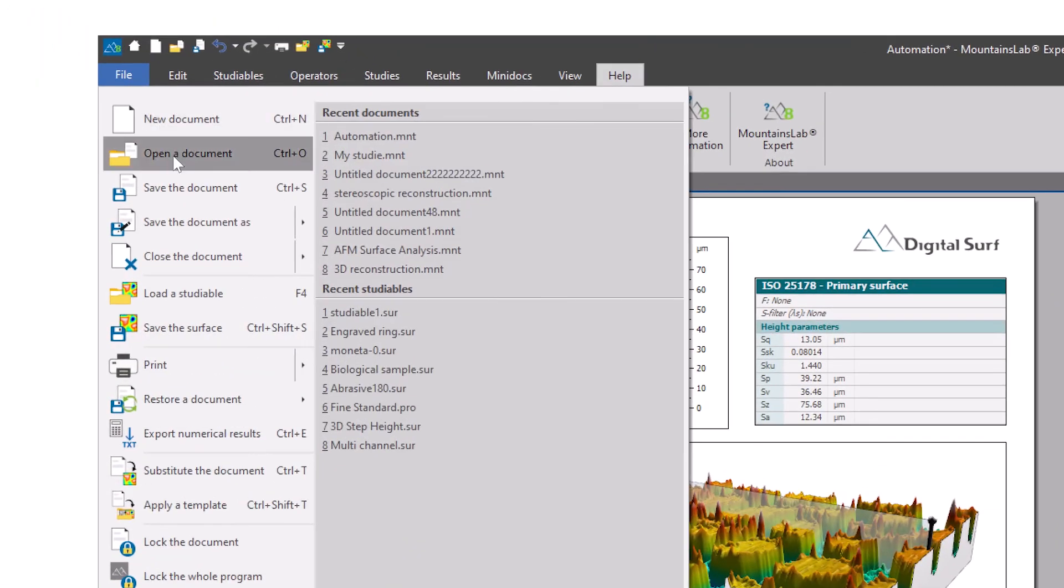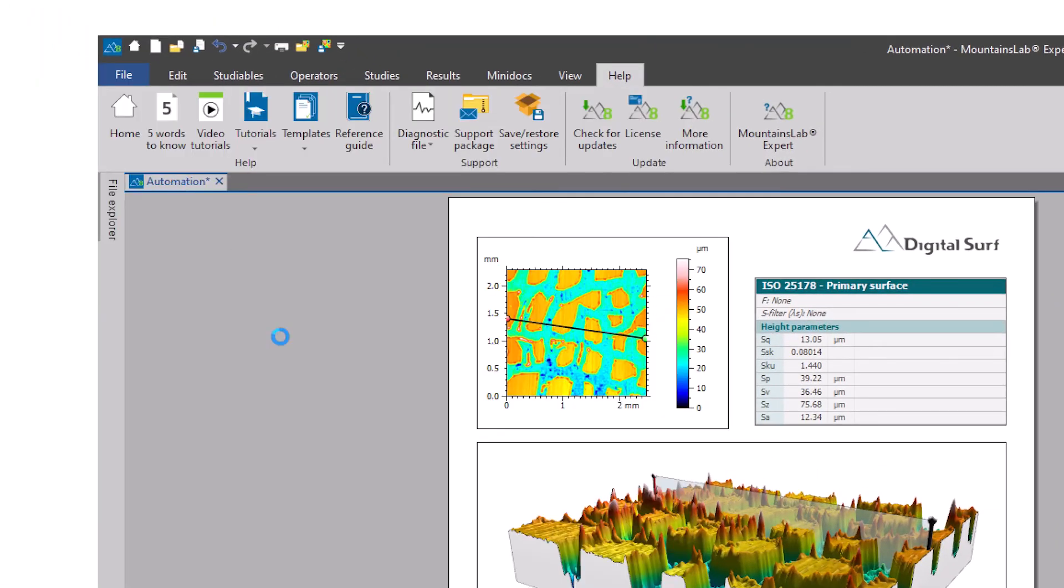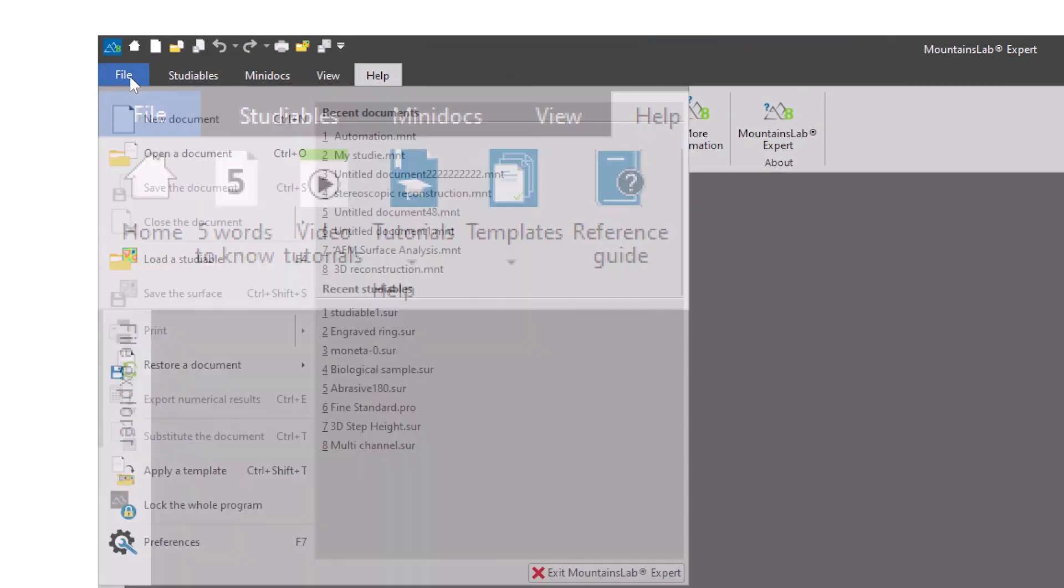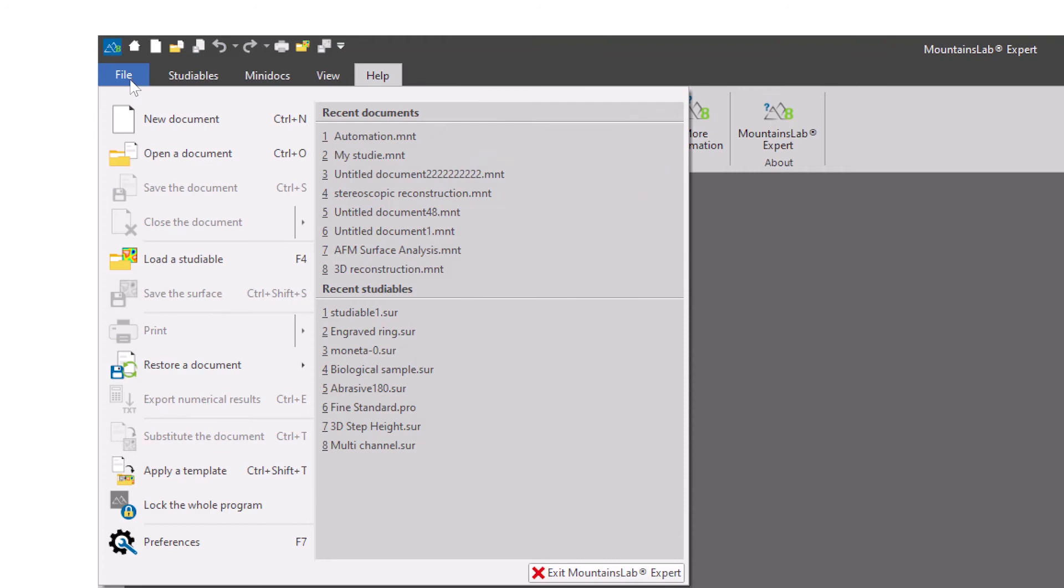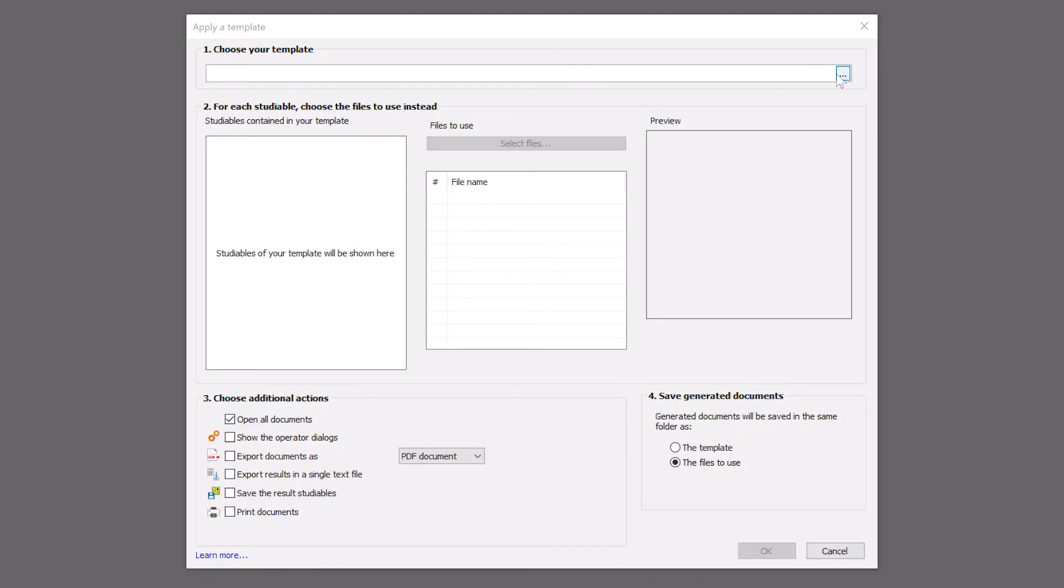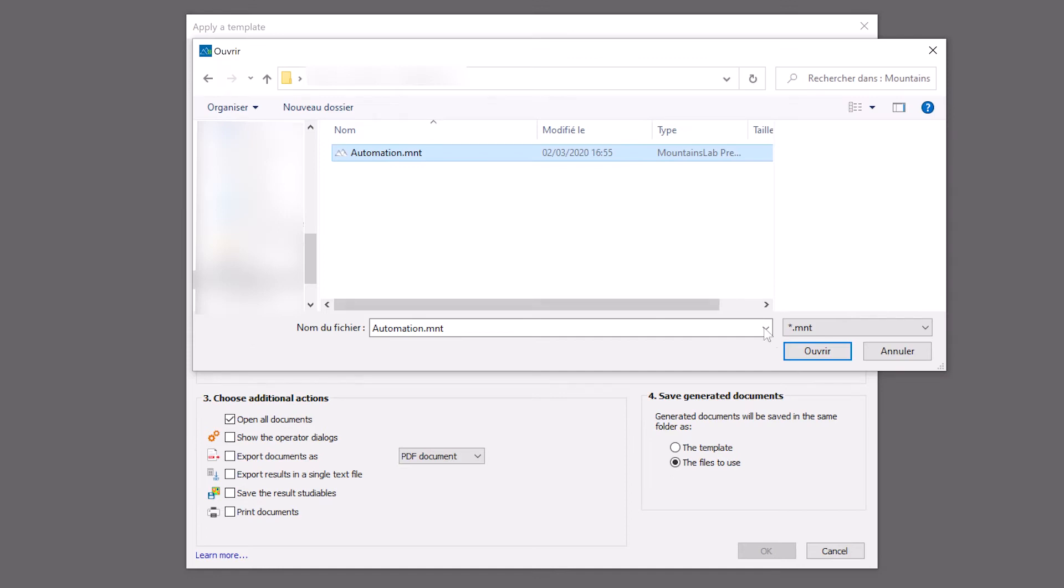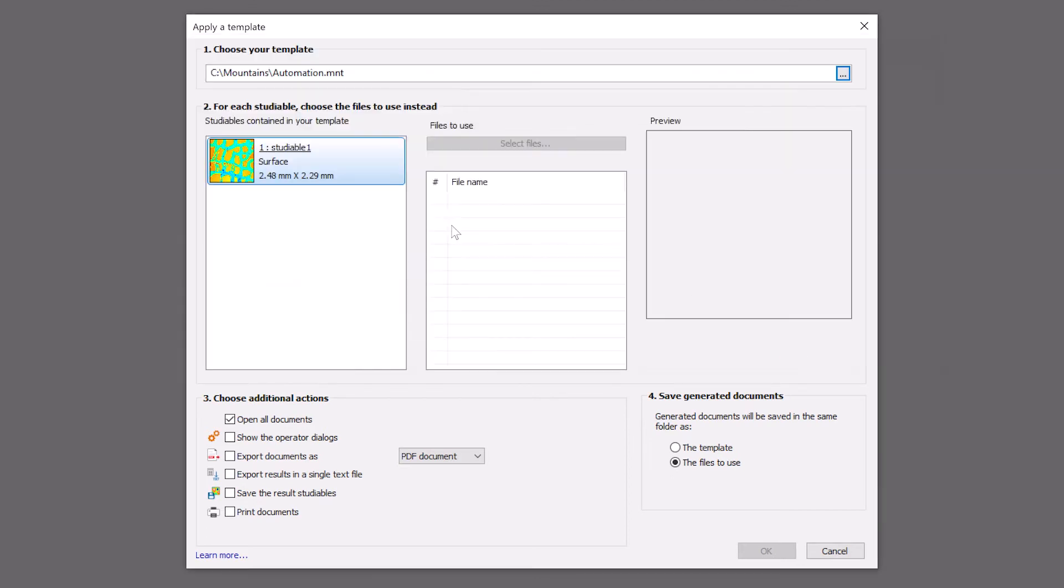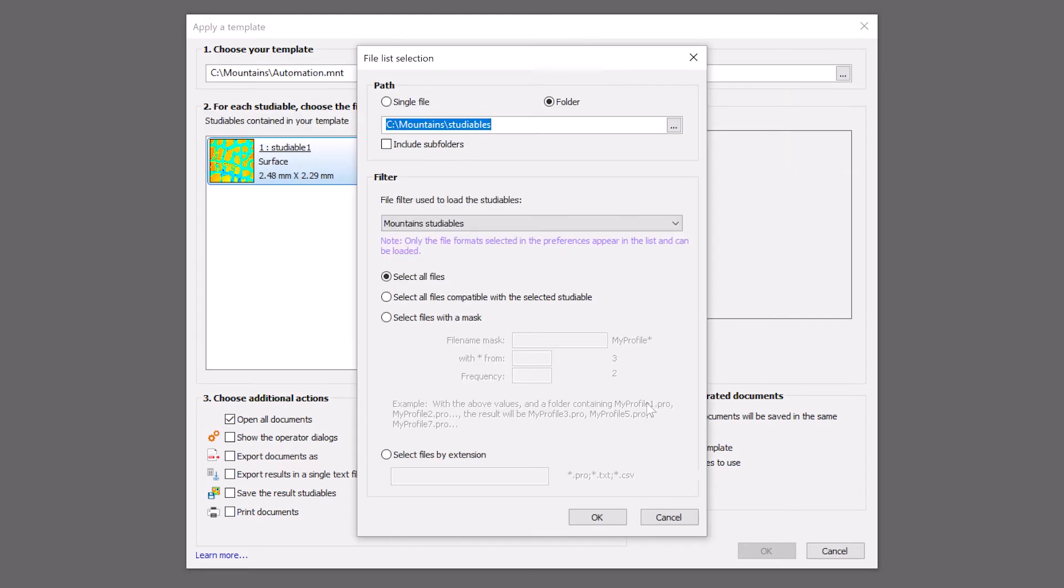All I need to do is save my document, then go to the File menu, choose Apply a Template, retrieve the document I just saved as a template, then select the folder containing my other measurements.